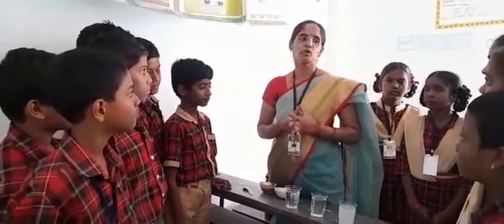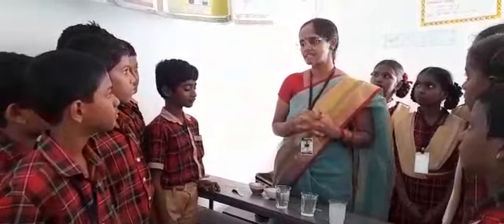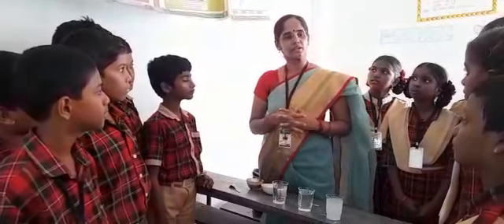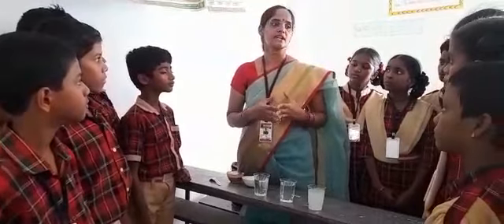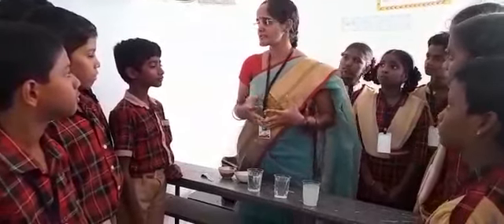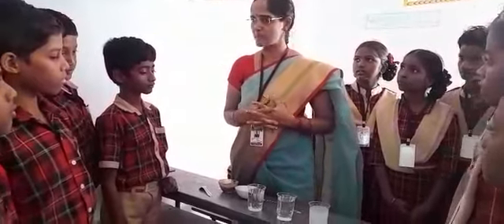So today we are going to learn about an important phenomenon in chemistry, that is Tyndall effect. Before learning what is Tyndall effect, we are supposed to be clear with certain terms, like what is meant by solution, what is suspension and what is colloid. These terms we are going to learn experimentally today.